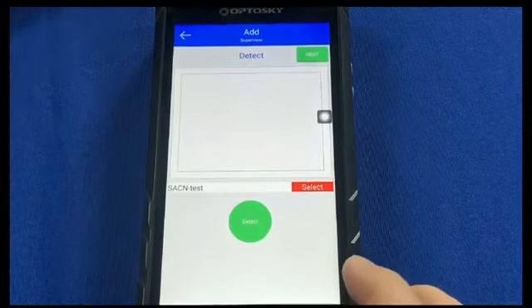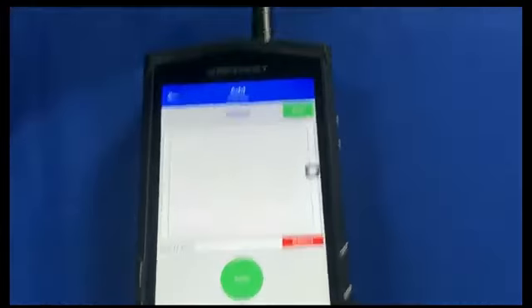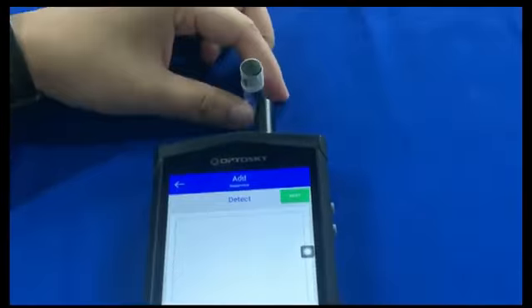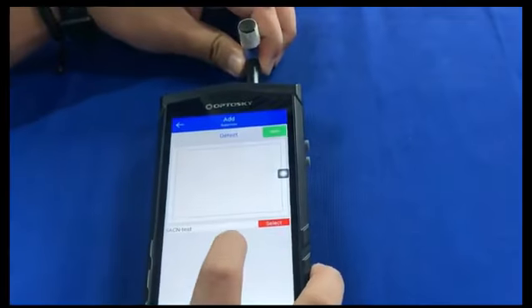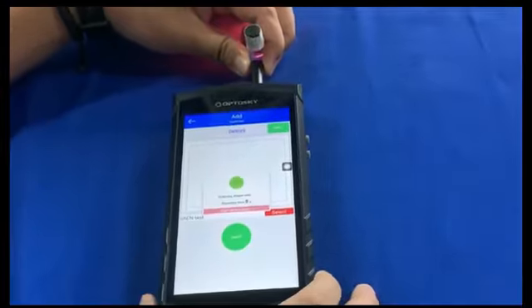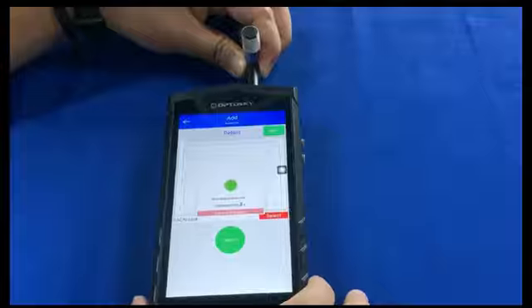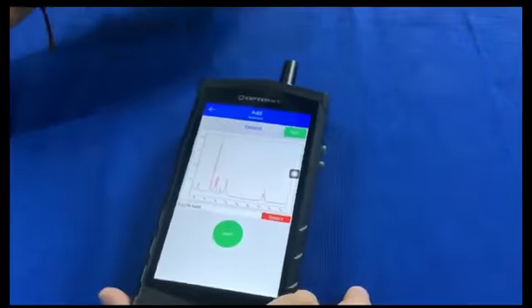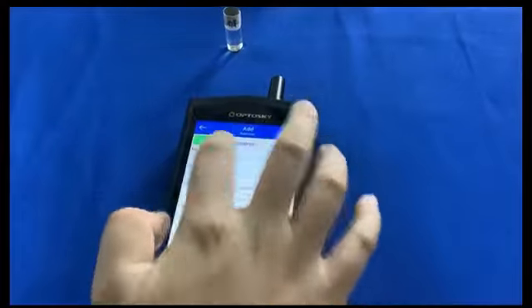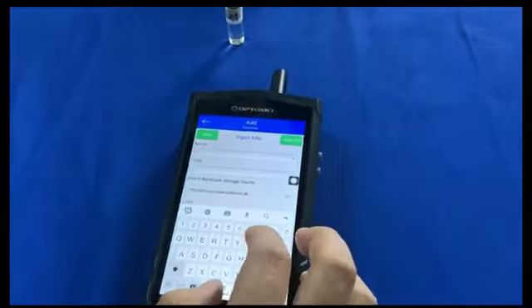The CAS number is just for our reference, so the user just needs to input any CAS number, but it cannot repeat, and save to the test lab library name. The library has different folders. You can save your own library.